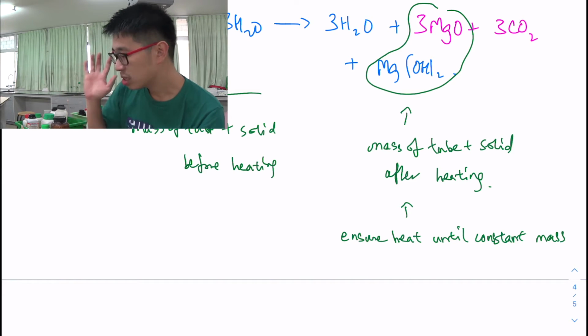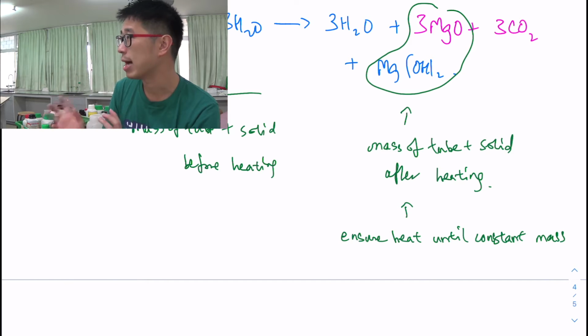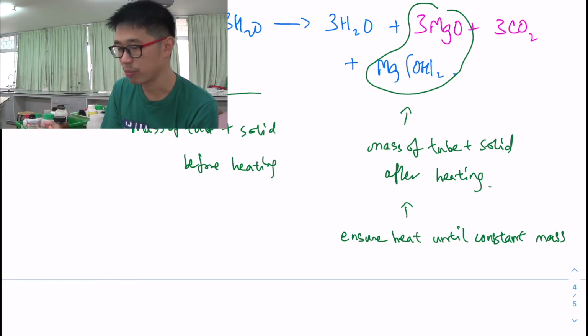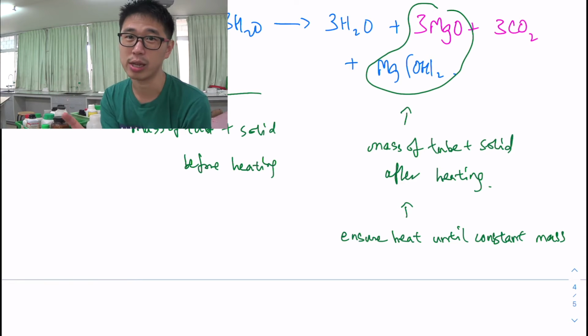Okay, so that was just an example of another mixture of two compounds. It wasn't exactly a salt, because magnesium hydroxide is a hydroxide, what you call a base, an alkaline solid. Actually, alkaline is only for solutions, so it's a basic solid. So you have a base and a carbonate. This is called a basic carbonate, basic because it's the adjective for a base, and it's a carbonate, so it's called basic magnesium carbonate. You have here another example of something similar. This is called zinc carbonate basic.